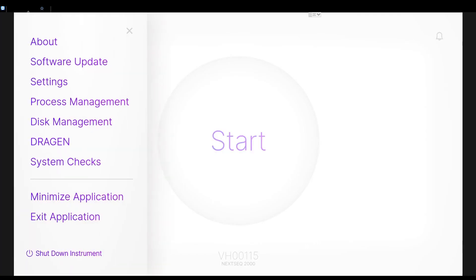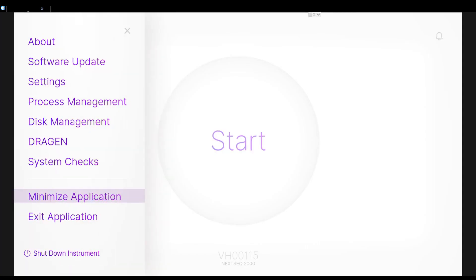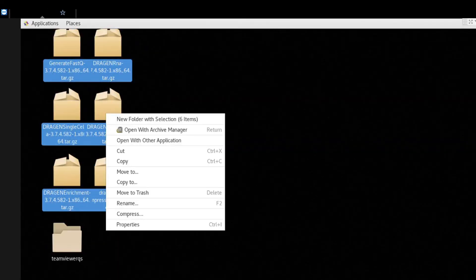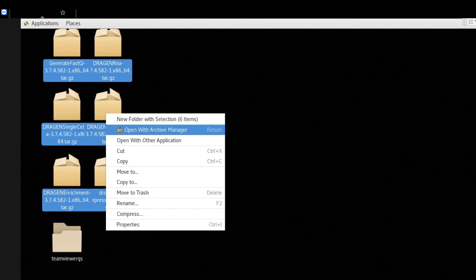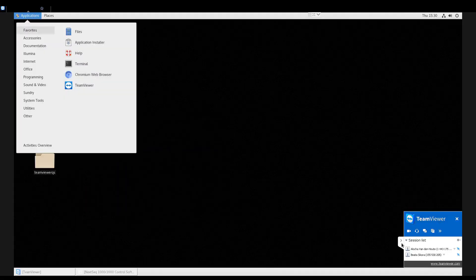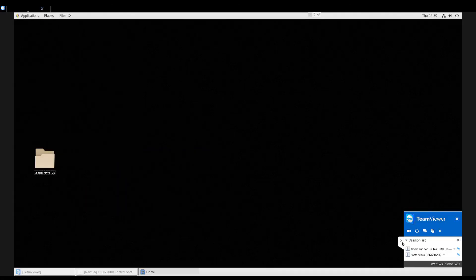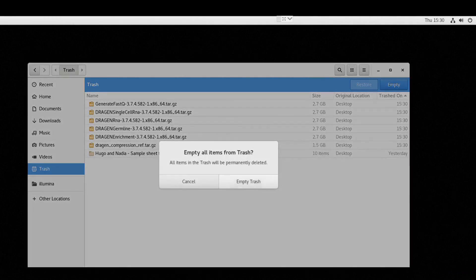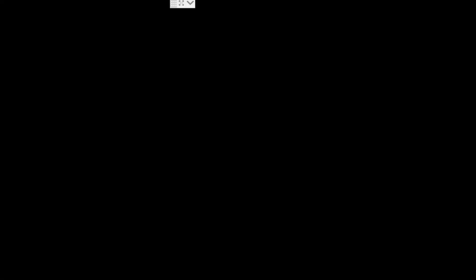Final Steps: After installation is complete, delete all the downloaded installation files and empty the trash to save space. Log in as Illumina user to begin sequencing.